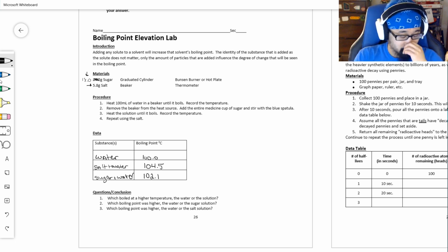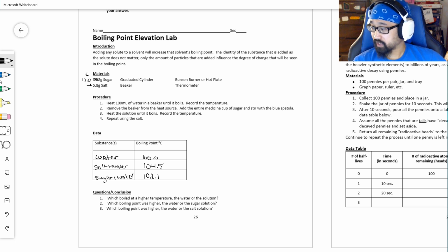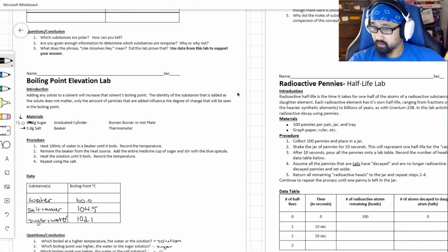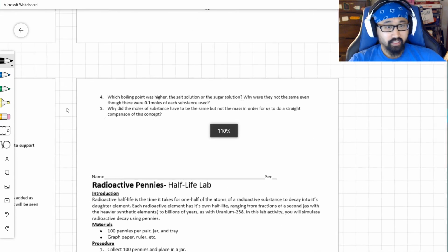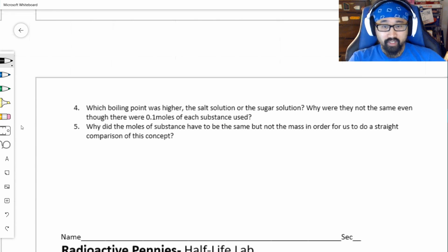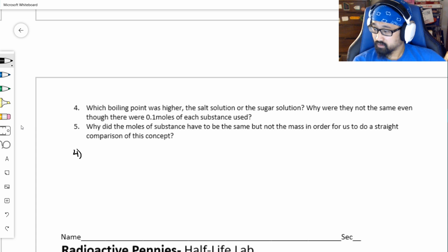So when we talked about the questions, what boiled at a higher temperature, water or the solution? Well, this is either solution, right? The solution did. Water or the sugar solution? This was the sugar by far. Water or salt? This was the salt. Those 3 questions are very straightforward. The other 2 questions are a little less straightforward, and again, I don't know why the separation happens the way that it did. But which boiling point was higher, the salt or the sugar? For number 4, salt water was higher.